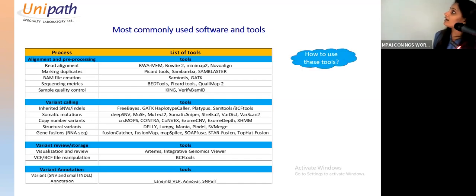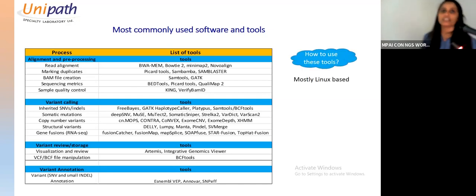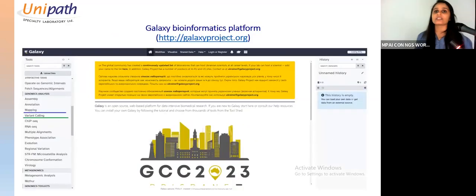So how to use these tools? Mostly they are Linux based. This is actually a very typical implementation. When you look at the screen of a bioinformatics person and sit beside them, you'll feel it's very boring. But for bioinformatics, it is actually very interesting.